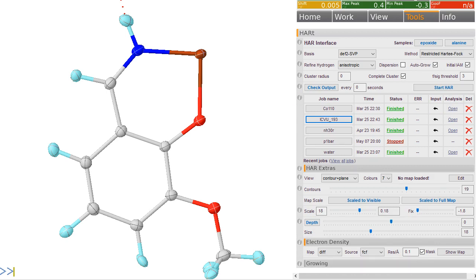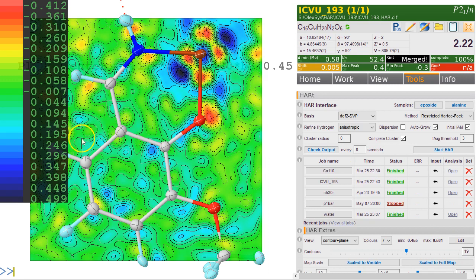If I switch the map on now, we see there is very little residual density between those bonds. That's because we've been using form factors that are no longer spherical, and therefore the electron density in those bonds has been modeled as well. The R-factor is also much lower at 2.22% in this case, and we don't have any Q peaks in those bonds.